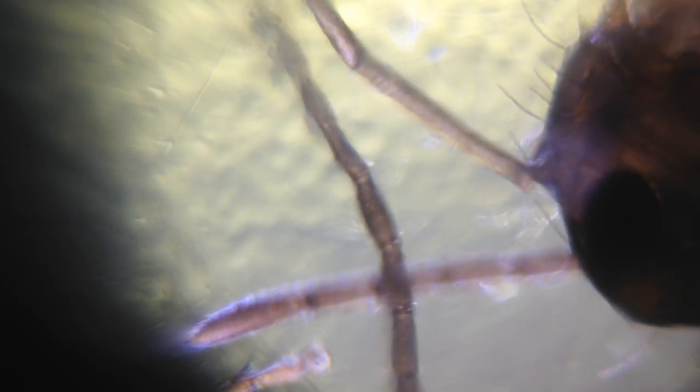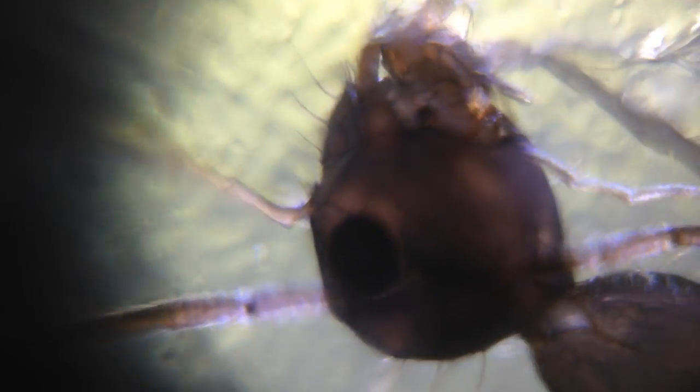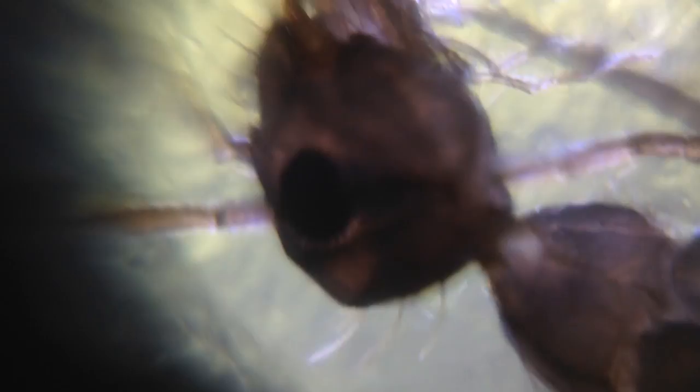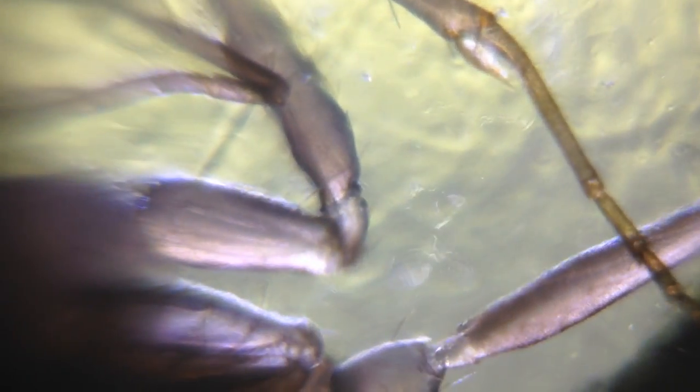I'm going to change the focus now so that I'm focusing back on the ant. You can see its head right here. I'm going to move down its body now. So we've got its legs.